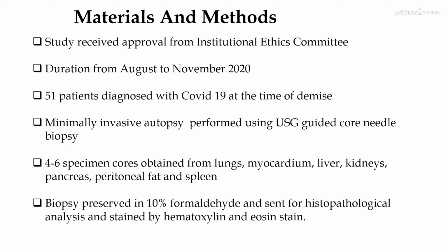This study was a prospective observational study conducted during the peak of the pandemic, between August and November, and 51 patients diagnosed at that time were included. The minimally invasive autopsy was performed on lungs, myocardium, liver, kidneys, pancreas, peritoneal fat, and spleen. Pancreas and peritoneal fat did not show any significant finding, and organs such as brain, stomach, and intestine were not included in our study. These biopsies were preserved in formalin for 48 hours, sent to the histopathology unit, and stained with H&E.